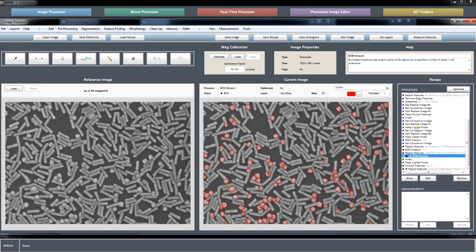It's an extensive recipe. It's got a lot of arithmetic back and forth between layers, but set aside a few minutes for yourself to think through the arithmetic, and hopefully once you have it, this will work okay on different images. So there are different types of microstructure feature segmentation. In some, all the features have the same intensity and they just differ on shape. In the example we just saw, and in Meg's titanium images, you've got different intensity and feature scale in the different areas, so you need some different steps to split out the different features that way.